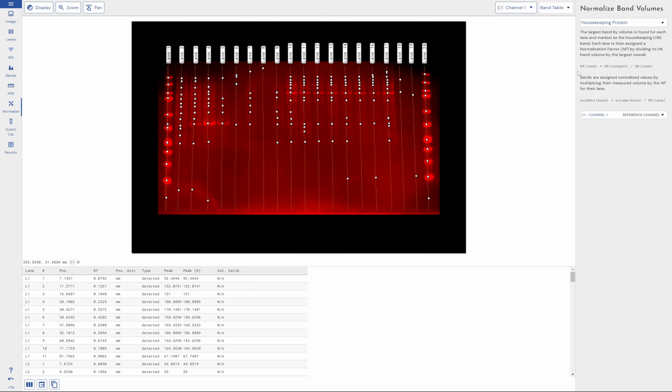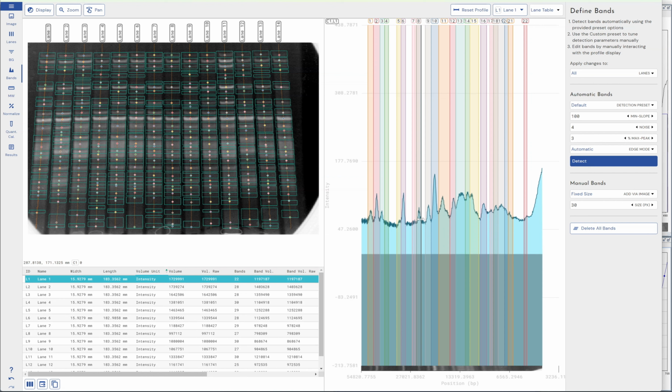So that's a real standout difference between the two packages of software: if you are trying to do anything with multi-page, multi-channel TIFFs, any type of normalization, even if it's just within image, you don't have that facility within GelAnalyzer. Overall, GelAnalyzer has done a passable job, it's done a good job. I've picked it up pretty quickly. I still haven't worked out why the standard manager is there if you need to type them in automatically, but I'm sure with some reading I could find that out.